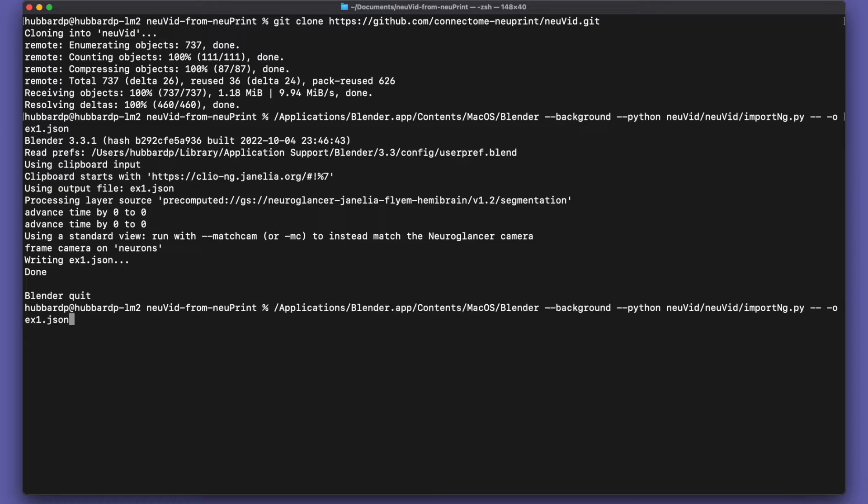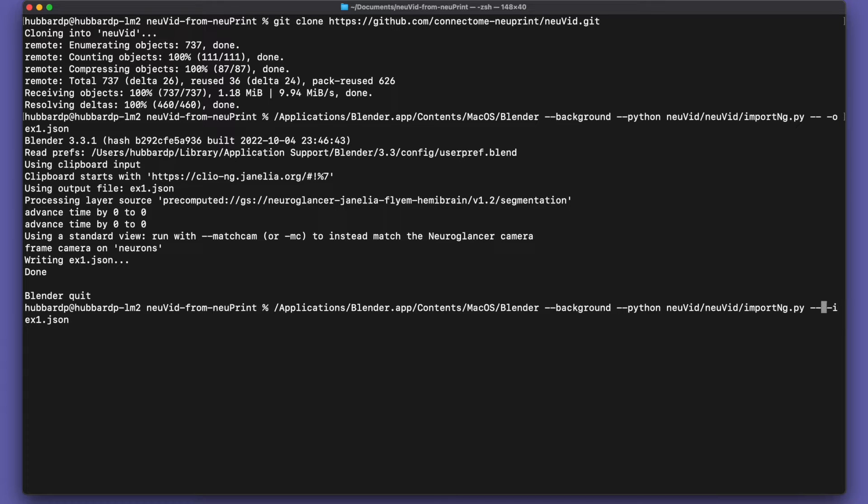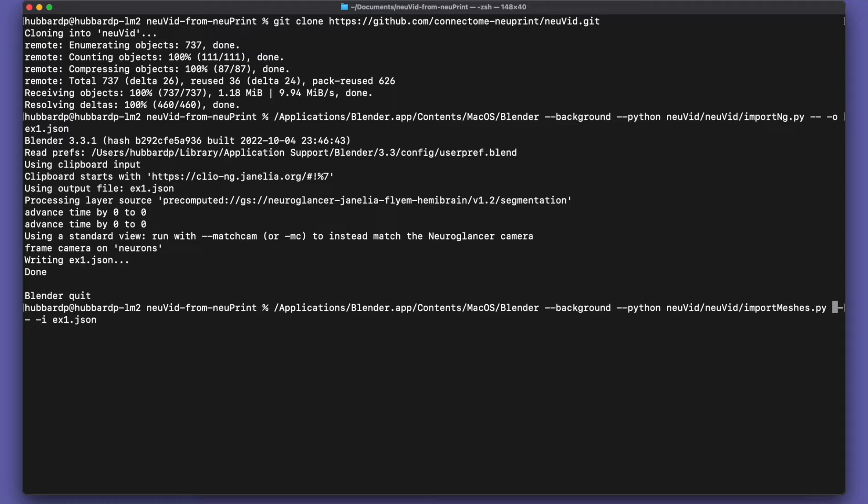Now I can press the up arrow in the shell to get the previous command again and edit it. Now I'm going to use that JSON file as input to the script to bring down the meshes that I want to see.